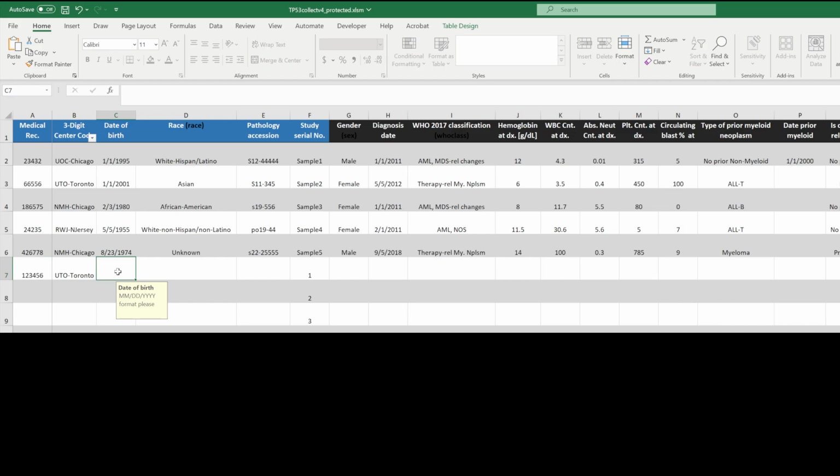Let's say this patient was born on 1/1/1966, and then you can drop down and raise. The moment you tab, you go to the next field. That's a much better way to move between fields. Then you enter your number. Let's just say your number was UTO21 dash something. And then this column will be locked. Serial number is already there for you, so you cannot click and change it.